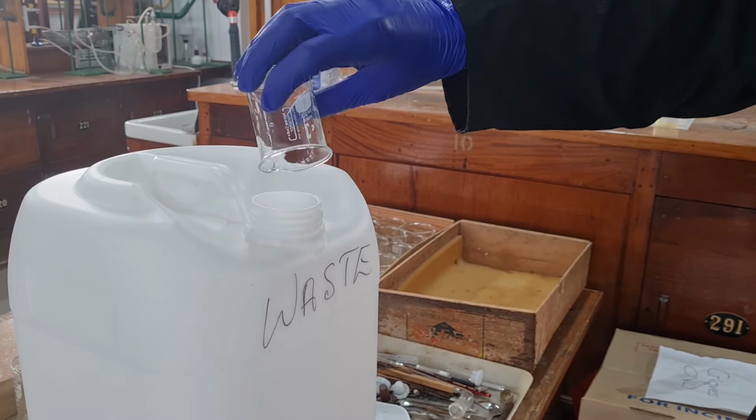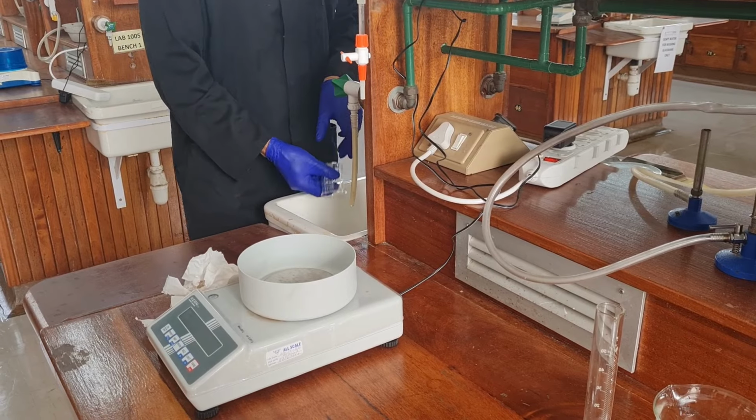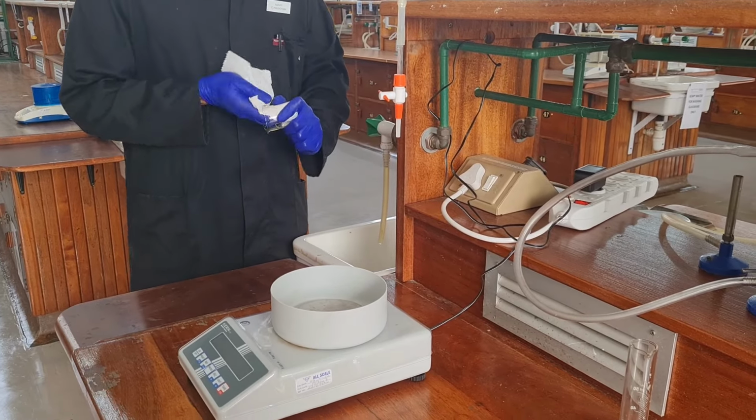Pour out the unknown solution into the supplied waste bottle, rinse it with water and dry the beakers using a paper towel. The paper towel can be found in the middle of the lab.